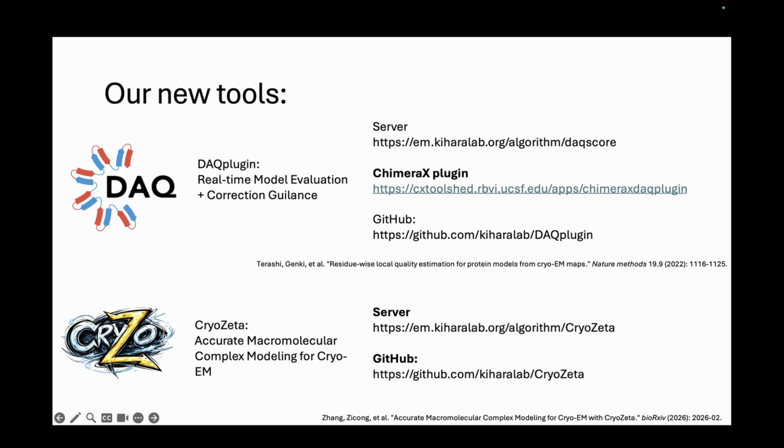For CryoZeta, we demonstrated how to use our CryoZeta server. It provides very accurate macromolecular complex structure modeling. Of course, the source code is available on the GitHub page. If you want to run CryoZeta on your computer, please visit this GitHub page. Okay, that's it from my side. Thank you for your attention. If you have any questions, please ask.